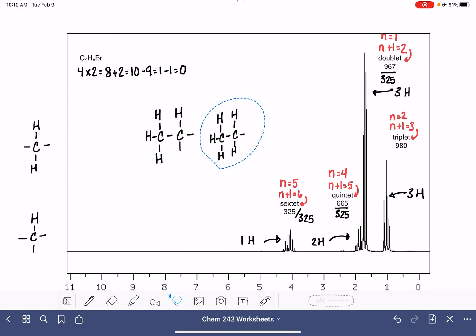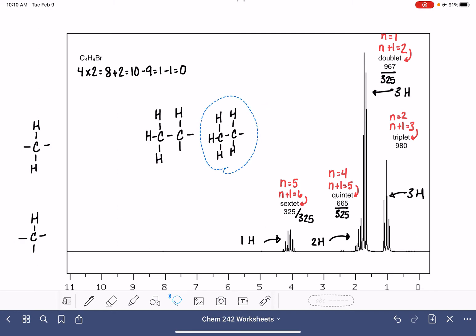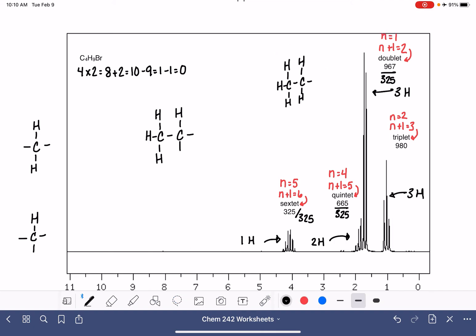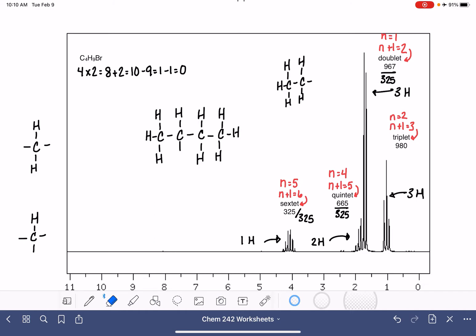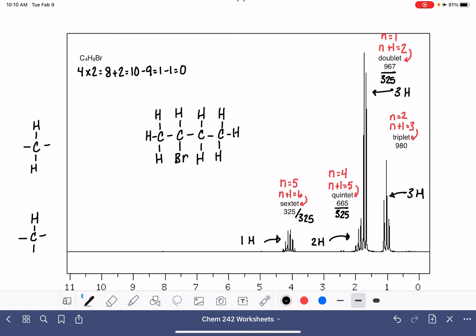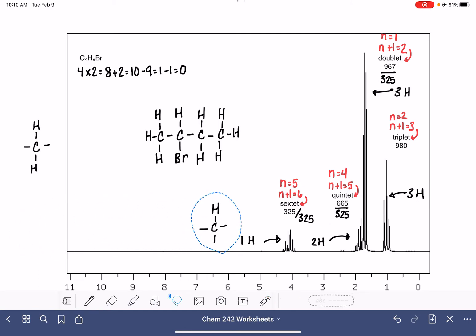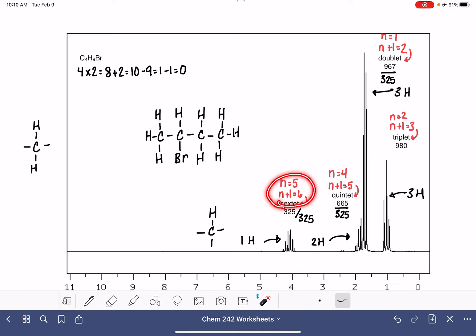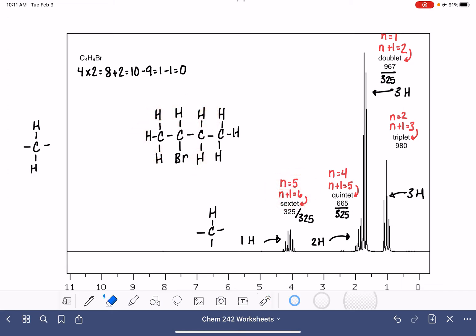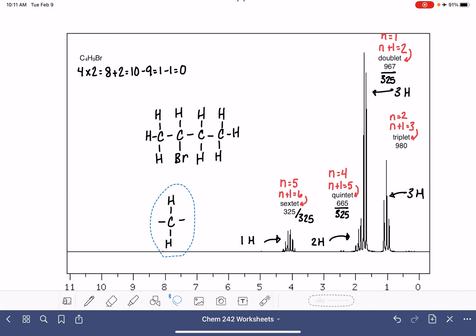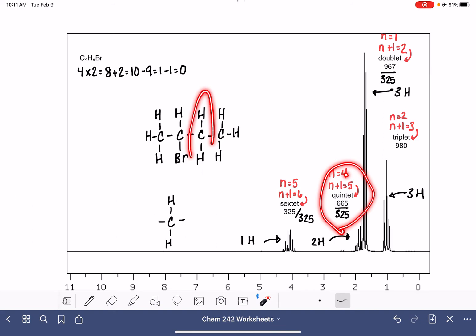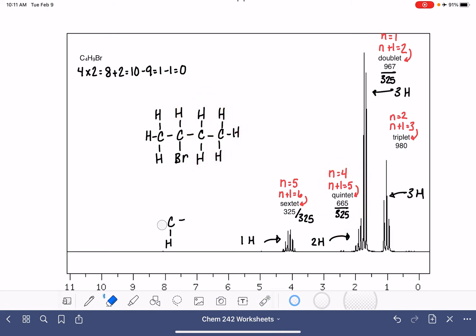Now I want to take these two portions of the molecule and fit them together. I'll redraw and turn it around so I can fit the two fragments together. Then I'll erase the old piece, and the last empty bond gets filled with the bromine. To double-check: the sextet should have five neighbors — one, two, three, four, five neighbors — that worked out well. And the quintet should have four neighbors — one, two, three, four — that also worked out perfectly. There's our structure.